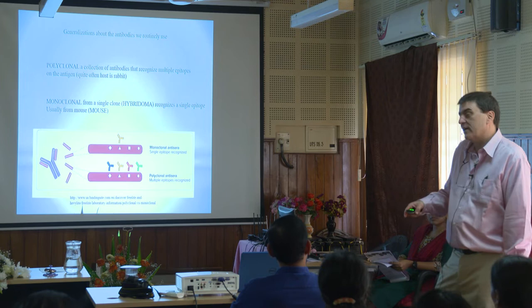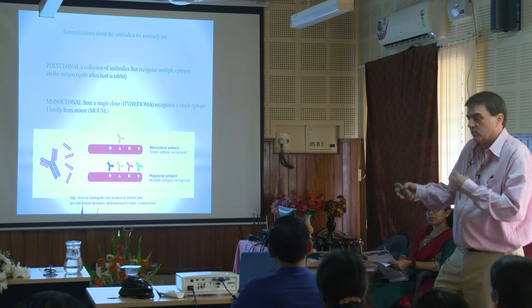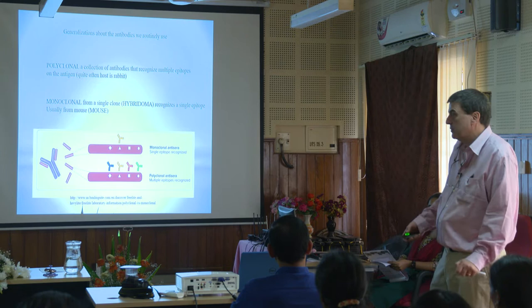When you get into secondary antibodies, a lot of times you'll see they use a goat or a donkey, a much bigger animal, so they can get more out. But I think a rabbit's just a lot bigger than a mouse, and historically it's just easier to work with, is my guess. Other than that, I don't know what the reason is. I'm sure there is a better reason, I'm just not aware of it.